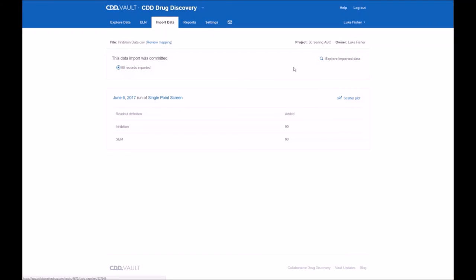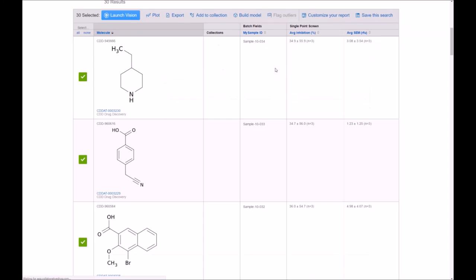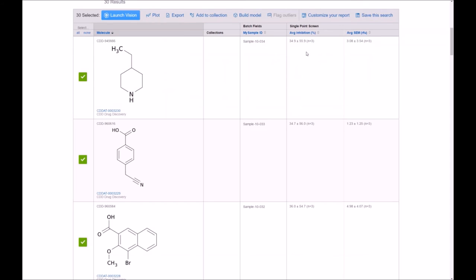And once we're done, explore what was actually read in. And you can see right away that the average inhibition and average SEM were calculated for each structure.